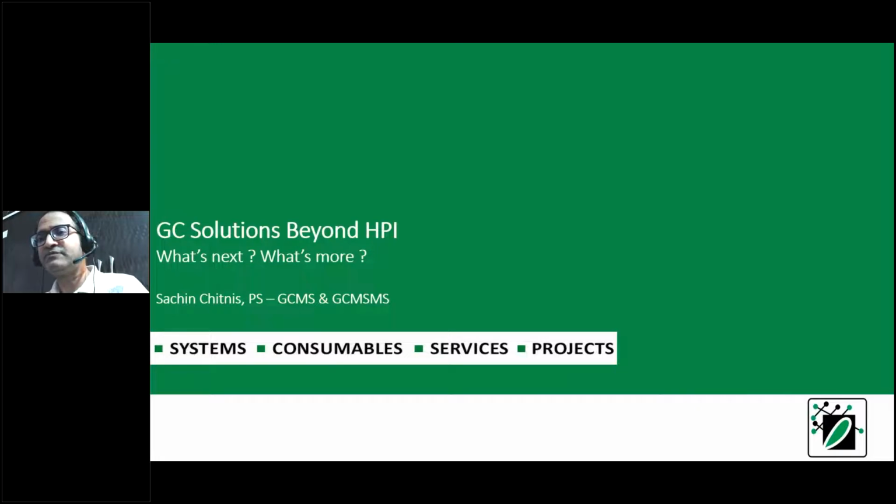Hello and welcome everybody. This session we are going to talk about the use of GC in different applications beyond the HPI industry. The typical use that we see of the GC is for the HPI, and for probably very obvious reasons, because the instrumentation is such that it suits the analysis, or vice versa, the types of compounds that we analyze in HPI industry are probably more suited for the GC analysis.